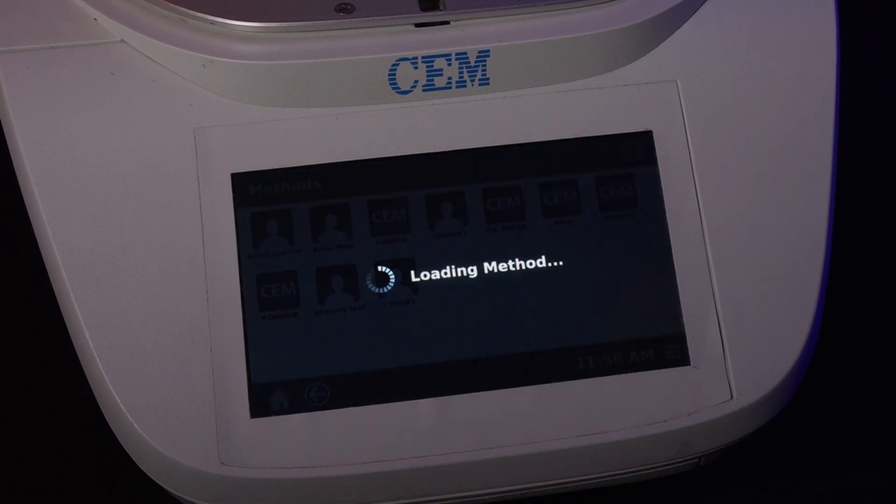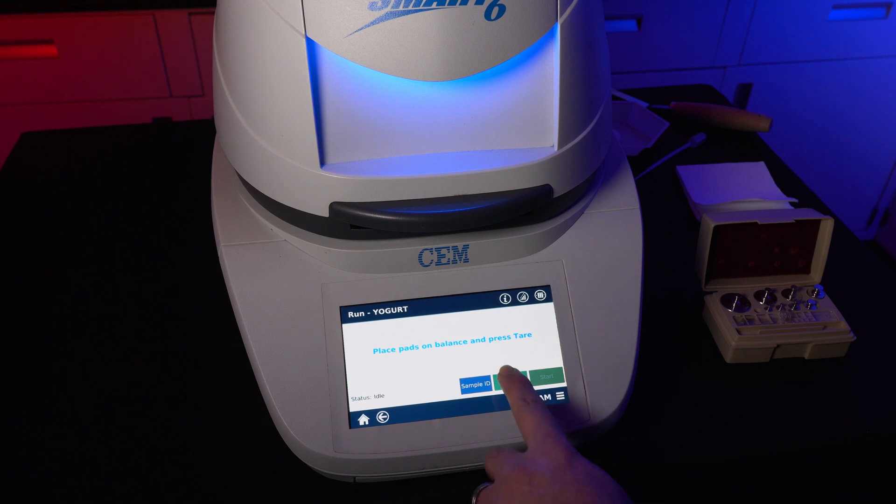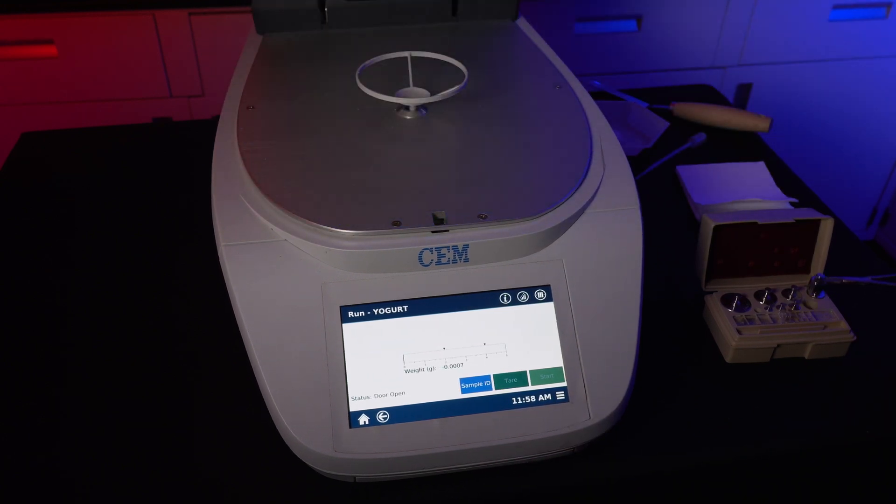To verify the balance calibration is correct, go back to the home screen and select any method. Close the lid, press Tare, and apply your 10 gram weight. Verify that the scale is displaying 10 grams. If the number shown is not 10 grams, rerun the calibration test again.